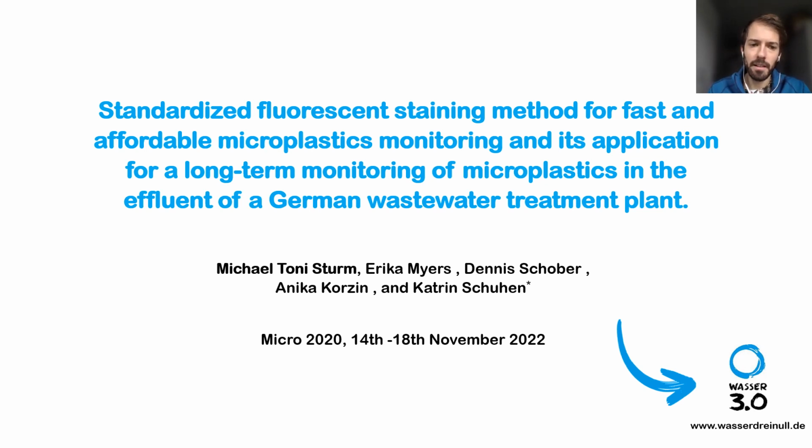Today I present a standardized fluorescent staining method for fast and affordable microplastic monitoring, and our results for application of this method in a long-term monitoring of microplastics in the effluent of a German wastewater treatment plant. My name is Michael Sturm and I work for Wasser 3.0, a German startup company which works on new and innovative methods for water and wastewater treatment.